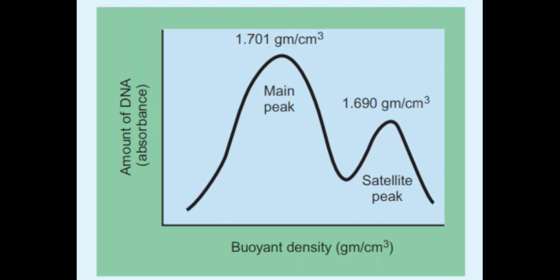So when you observe the gel membrane, the DNA settles in a band where the density is equal to the density of cesium ions. Why does this happen? Because the cesium ions bind to the DNA molecules and push them in the gel membrane. The DNA settles at a band where the DNA density is equal to the cesium ions. That point or band is referred to as the neutral buoyancy band.